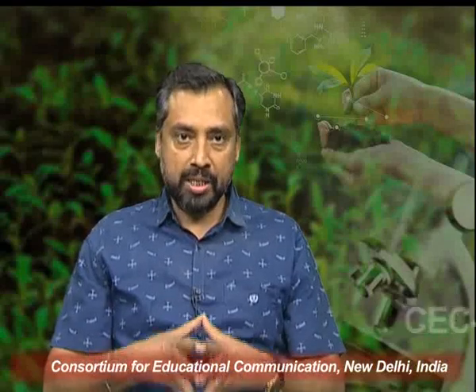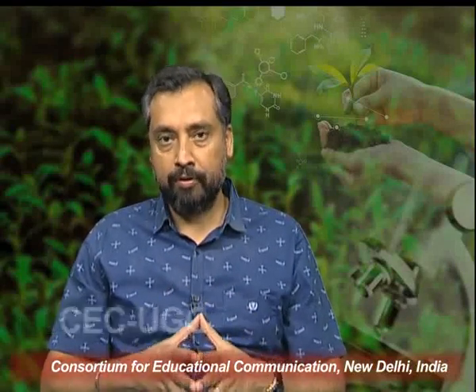A phase contrast microscope accomplishes this result in two steps. First, it separates the direct light that enters the objective lens from the diffracted light emanating from the specimen, and by causing these two types of light rays to interfere with one another, it produces an image of highly contrasting bright and dark areas against a uniformly illuminated background.